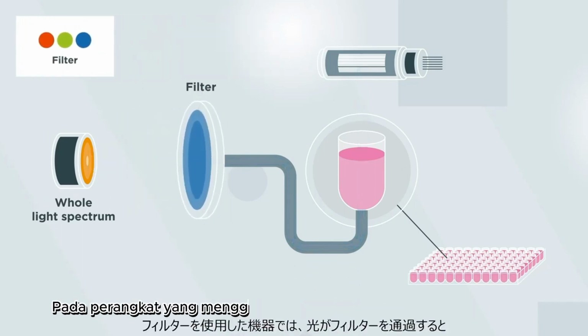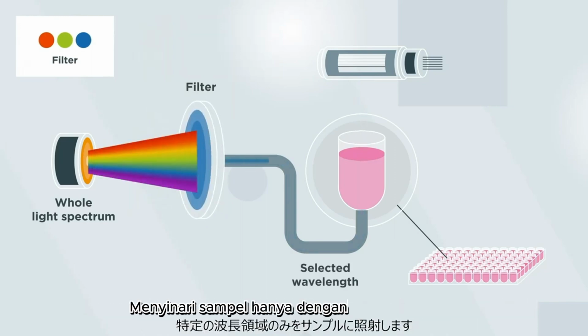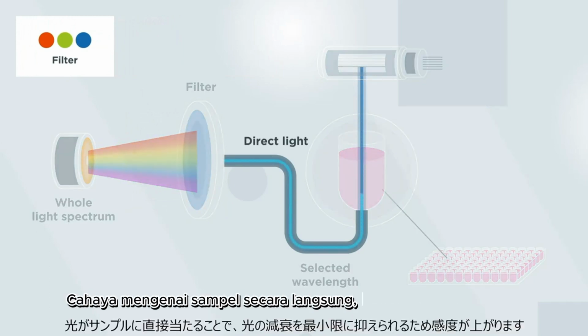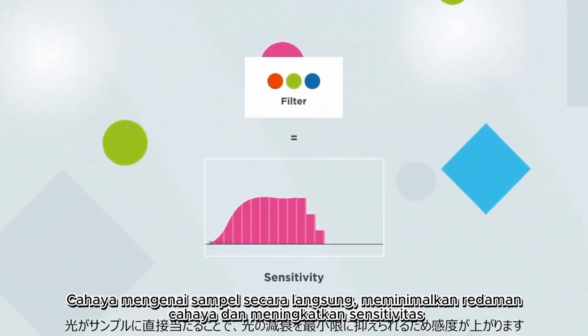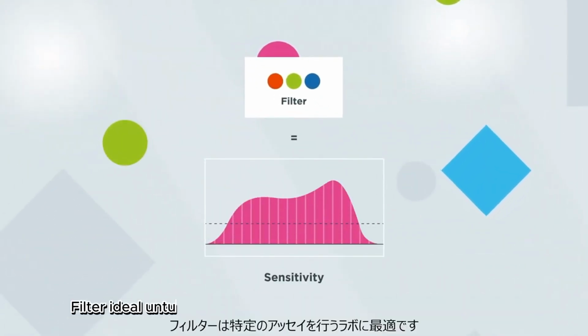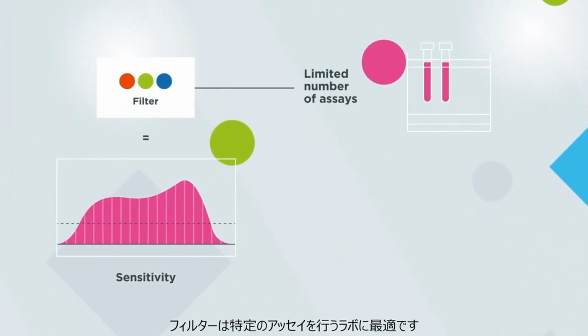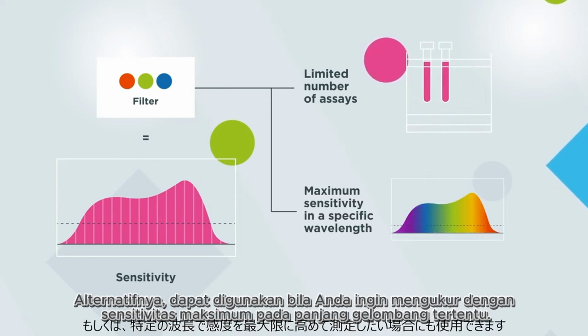In filter instruments, the light passes through the selected filter, letting only a certain range of wavelengths reach the sample. Direct light path means minimal light loss, which results in higher sensitivity, making filter instruments ideal for labs performing only a limited number of assays, or those looking for maximum sensitivity in a specific wavelength.